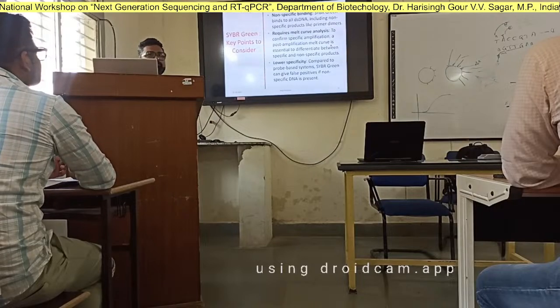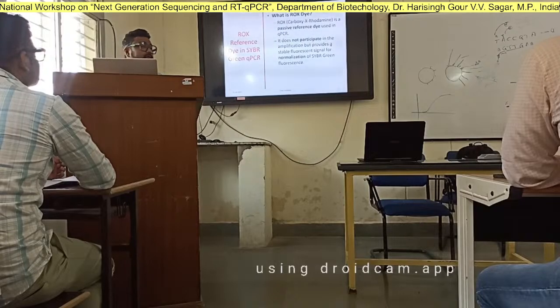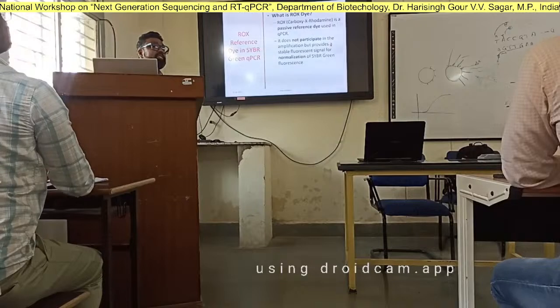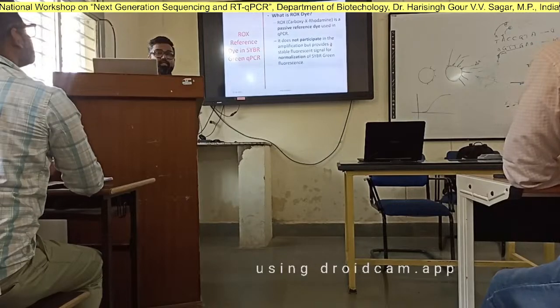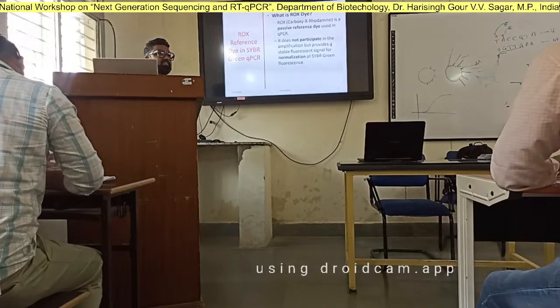False positive means आपको देख के लगेगा आपका DNA सिग्नल अच्छा है, your PCR curves are fine. When you go deeper into it, you realize all you are seeing is hallucinations. One more thing to protect you from this: most companies have another dye called a reference dye. That is ROX, carboxy-X-rhodamine, and it's a passive reference dye.